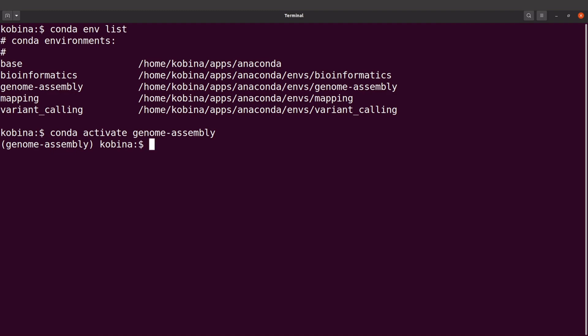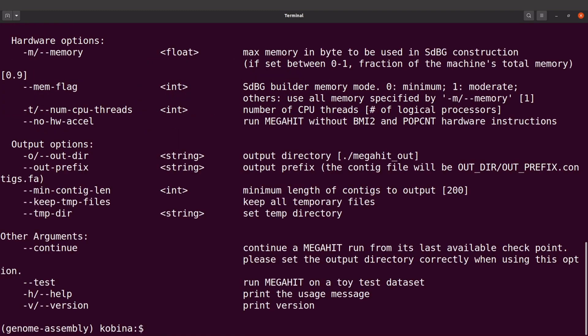That has been done. We have successfully installed MEGAHIT.